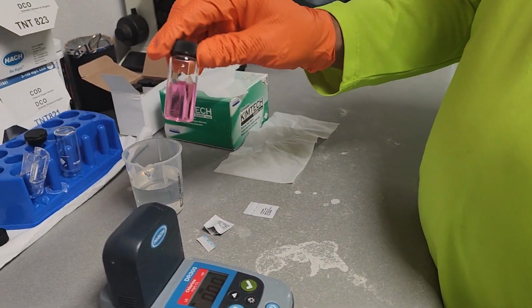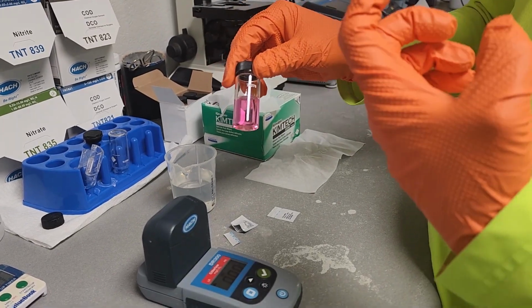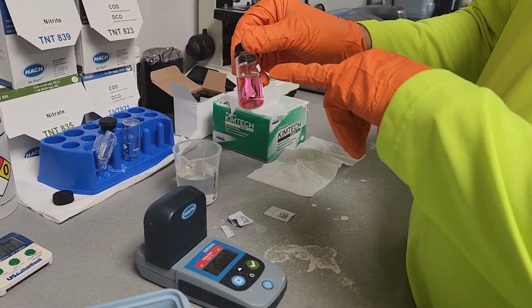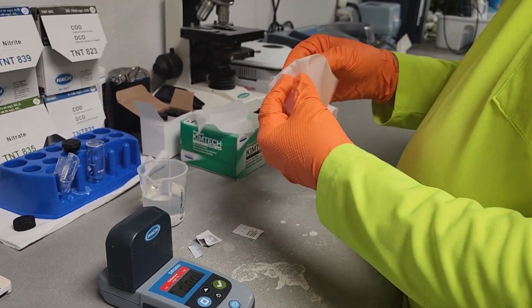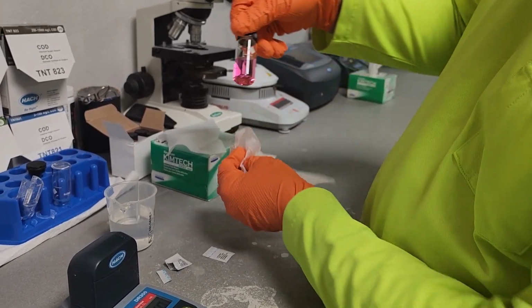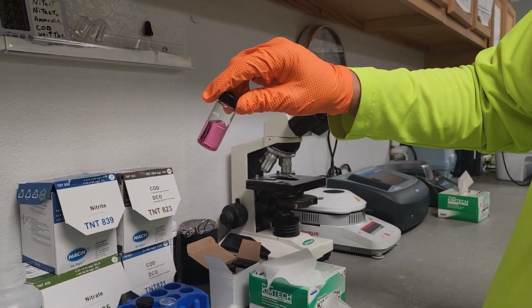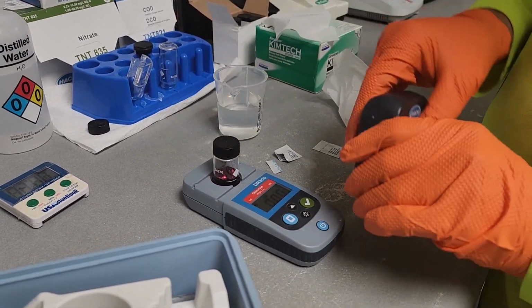Now, with a free chlorine residual, you want to give it a slight mix. You don't want to shake it. You rotate it, just like this. Don't worry about the reagent that doesn't dissolve; it's not going to interfere with the test. I'm going to clean off the sample cell again. I want it nice and clean. I don't want any bubbles. That's why I'm not shaking it. You see it's nice and clear. No bubbles. I'll set it down with the diamond at the arrow.